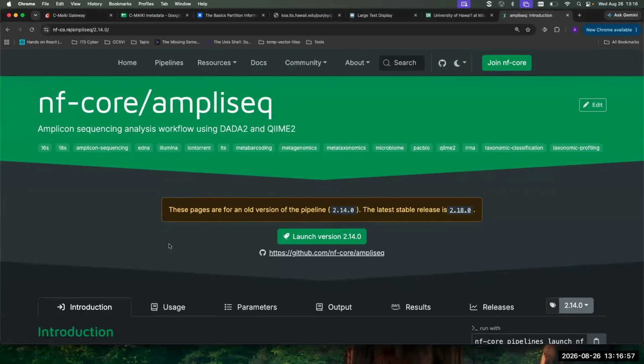Okay, so on the website, accessible through the gateway. Remember, the intention of the gateway is to make these pipelines accessible to people who cannot code with a command line interface. Generally speaking, if you're doing bioinformatics, you should probably be using the command line interface, but many students don't want to do that. We made this gateway that Andy just presented specifically for that use case. So all of the focus here is on making things streamlined and choosing options for you. The assumption is that you are doing standard pipeline work.